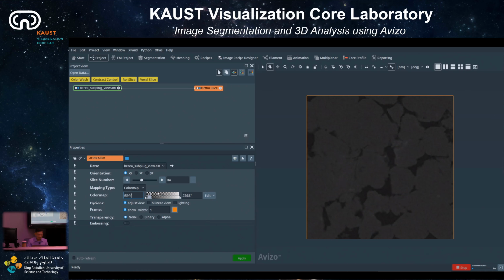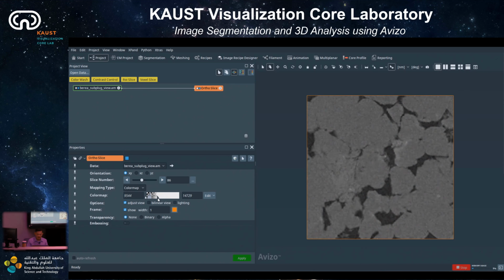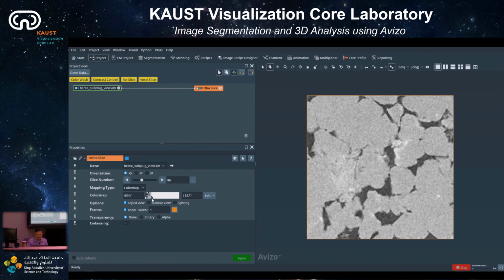As you can see in the histogram here, if you reduce the maximum intensity, that means any pixel that has values up to this value, 13,000, will become maximum. It becomes saturated, or you can adjust it more. You can see you clip or cap the upper intensity.